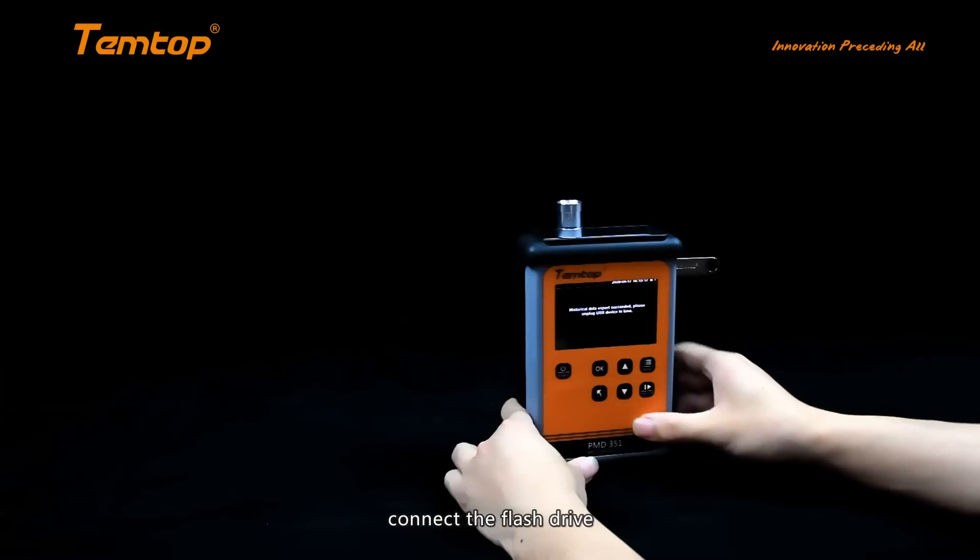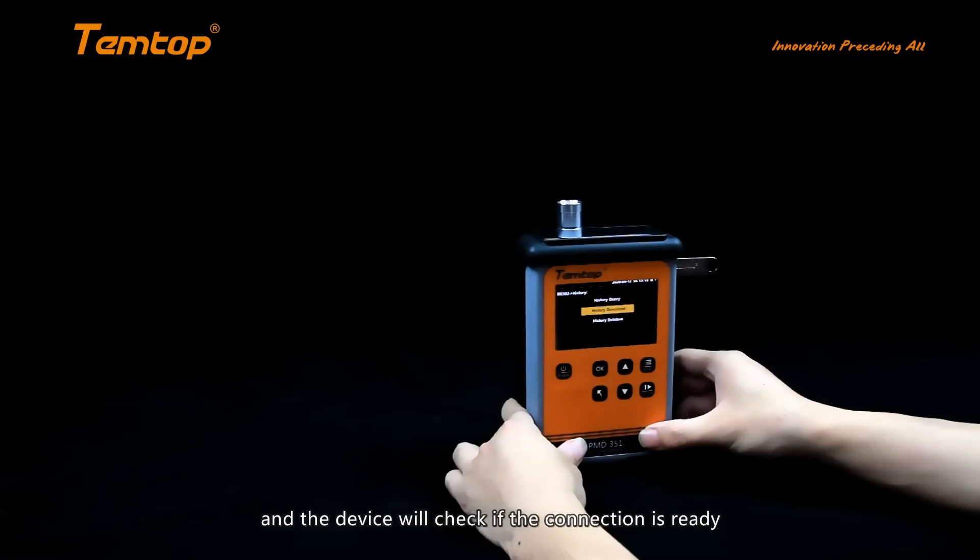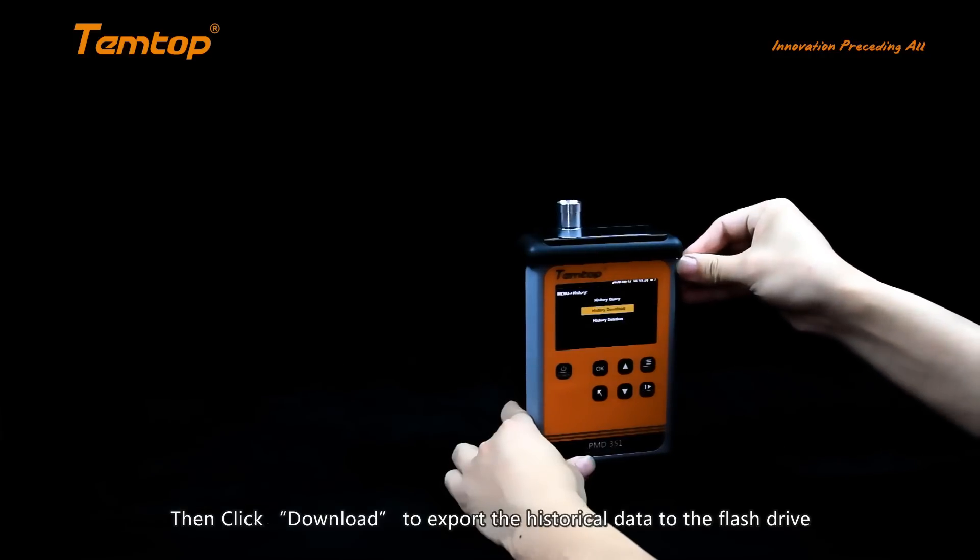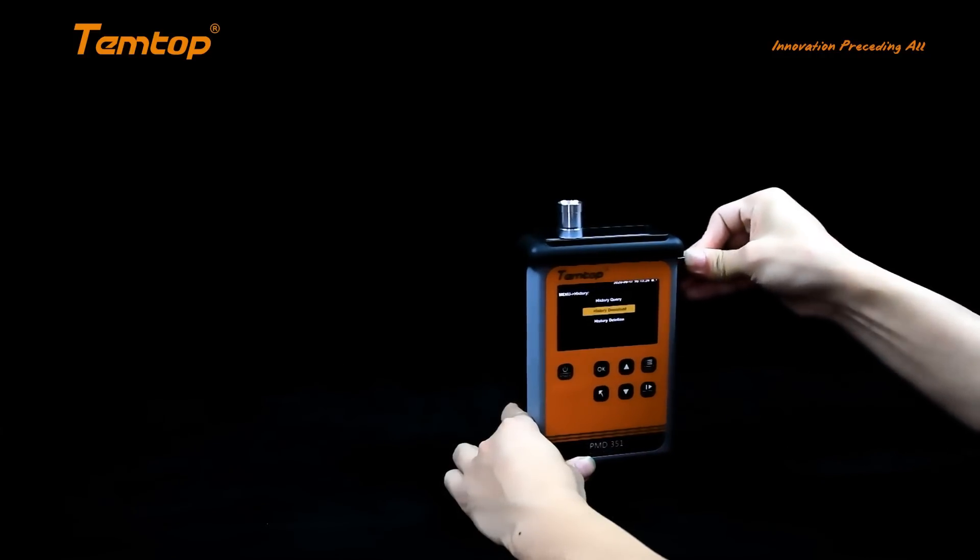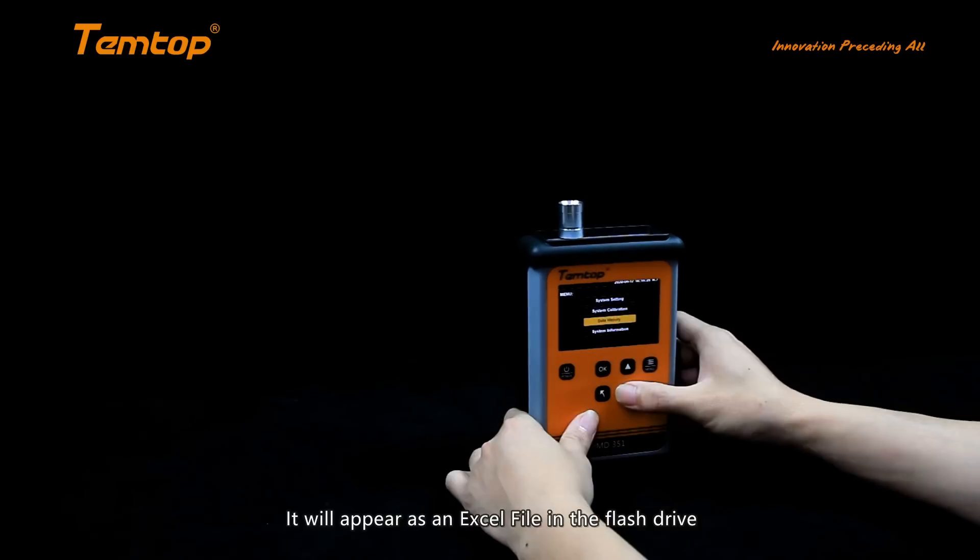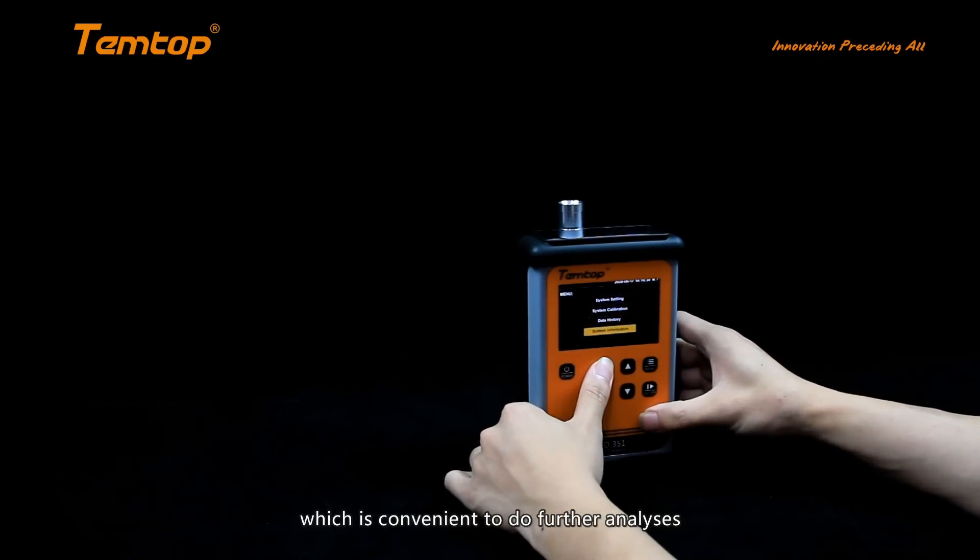It will appear as an Excel file in the flash drive, which is convenient to do further analyses. You have the ability to delete the data by month or the complete list.